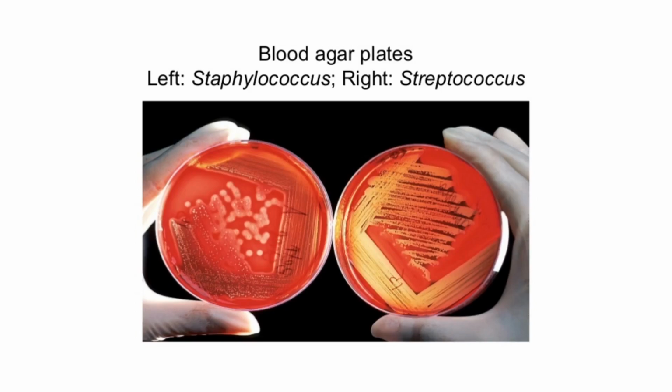We will start by talking about the different tests and results we can obtain from those tests in the different groups, and then you are going to use the results in a series of biochemical tests to determine the identification of 5 unknown bacteria. Because both of these groups have multiple species, and we only have a limited amount of time available, for the purpose of this exploration, we are going to limit our bacterial species to 2 staph species and 3 Streptococcus species.